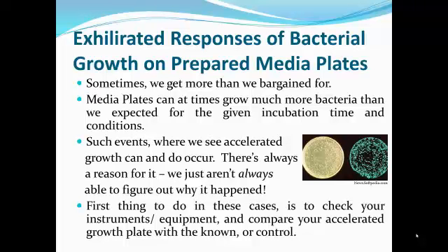First thing to do in these cases is to check your instruments, equipment, and compare your accelerated growth plate with the known or control.